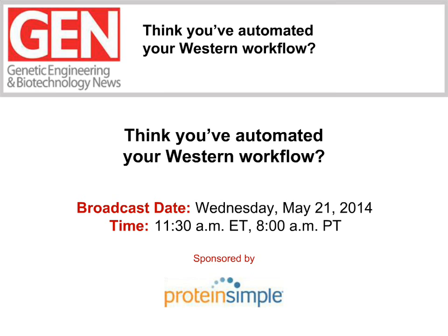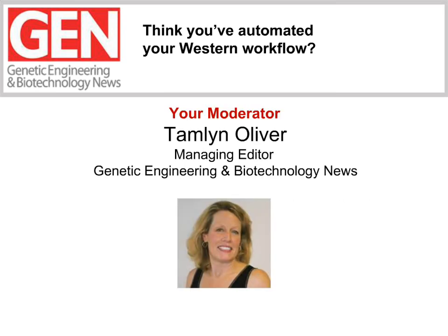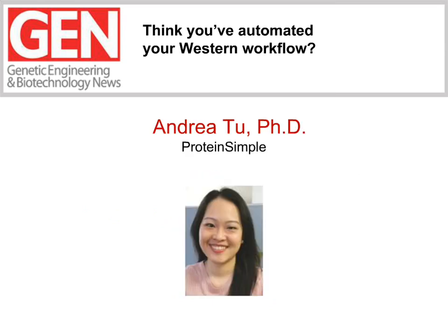I'm Tamlyn Oliver, Managing Editor of Genetic Engineering and Biotechnology News, and I'll be the moderator for this webinar. Our two speakers today, Catherine Hofler, Director of Research at Emerald Therapeutics, and Andrea Tu, Application Scientist at ProteinSimple, will talk about how the Simple Western platform integrates and automates all manual operations associated with Western blotting.